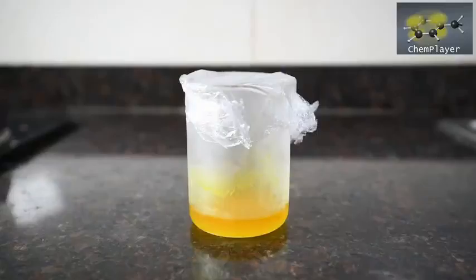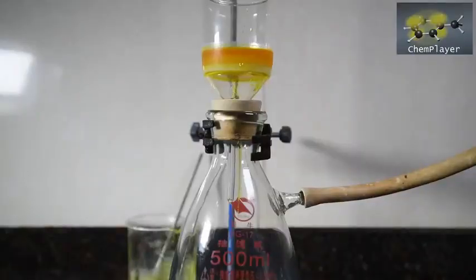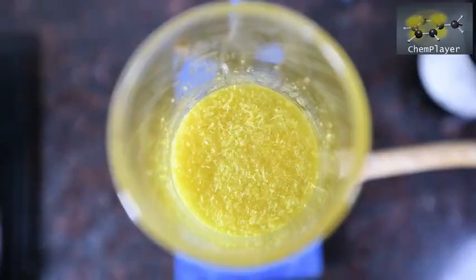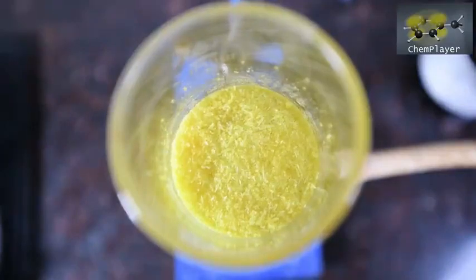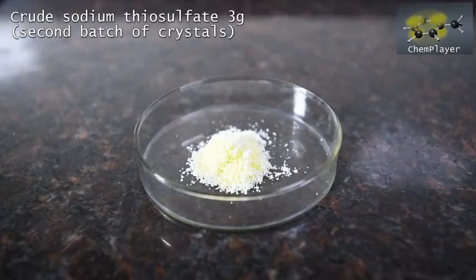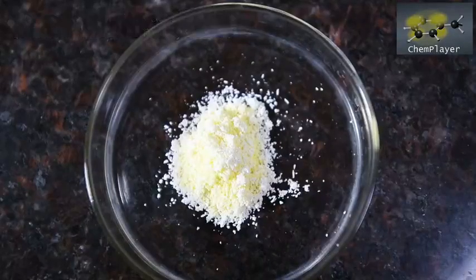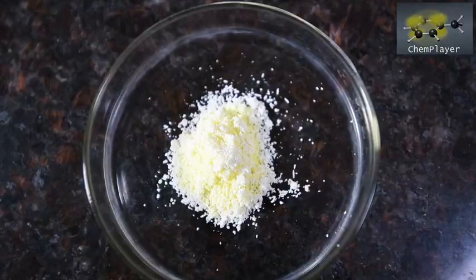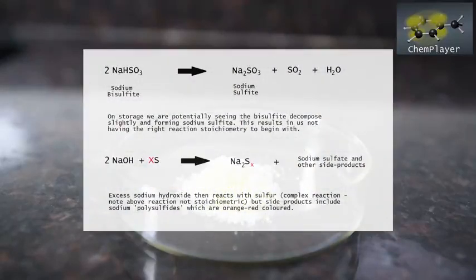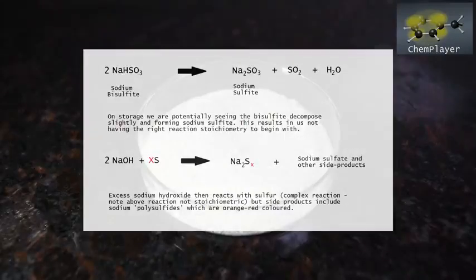After chilling the remaining filtrate, we got another batch of crystals forming overnight. After filtering and ethanol washing again, we've got another 3 grams of crude product, although slightly more discolored than the first batch. In total that's 25.1 grams of crude product, which in theory is a 55% yield if this is the anhydrous salt. We may have discovered the reason why textbook preps for this don't typically begin with sodium bisulfite — even storing it in a sealed container eventually results in some decomposition, making it hard to get the stoichiometry right and giving side products which make purifying the crude product much more difficult.